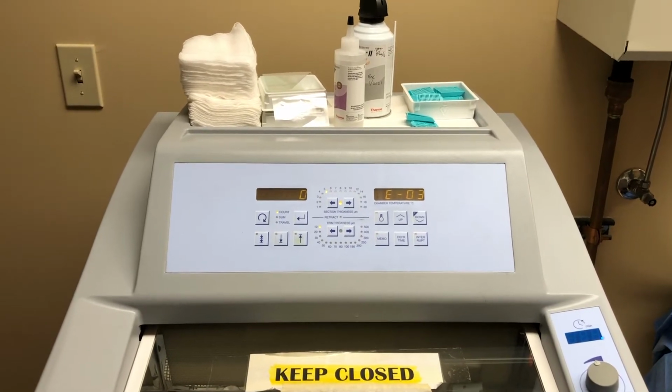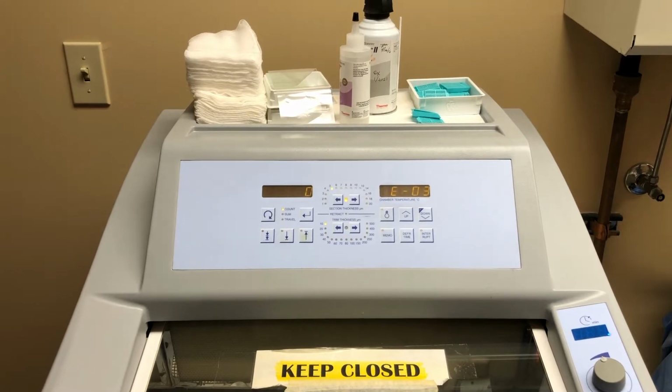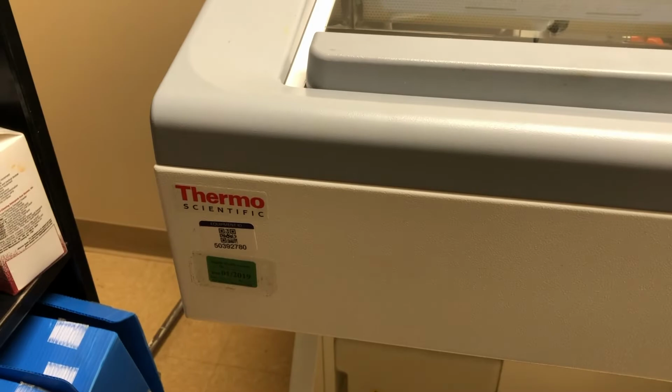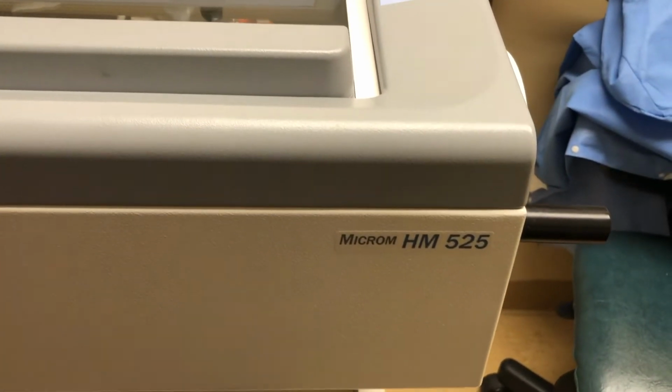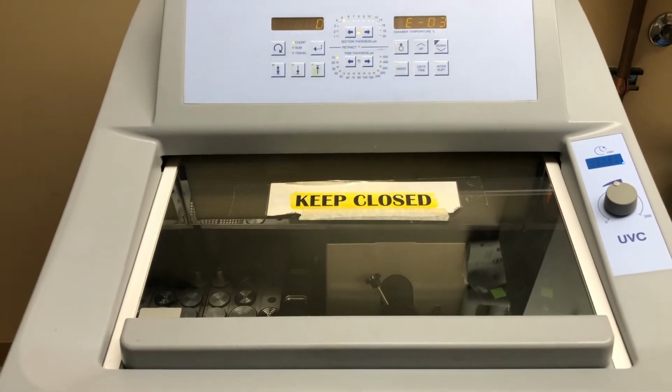Pardon how I sound, I have a mask on. I'm actually doing this video live from a customer location. I was called in to work on a Thermo Microm HM525, and the issue they were having was that their chamber temperature was above room temperature.